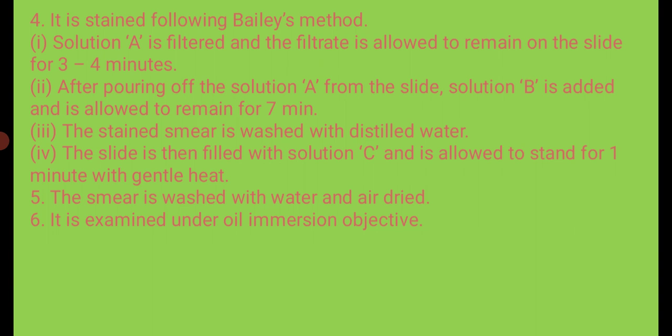Apply solution C and allow it to stand for 1 minute with gentle heat. Here the slide has to be kept in steam. After it, the smear is washed with tap water, air dried, and observed under the oil immersion lens.